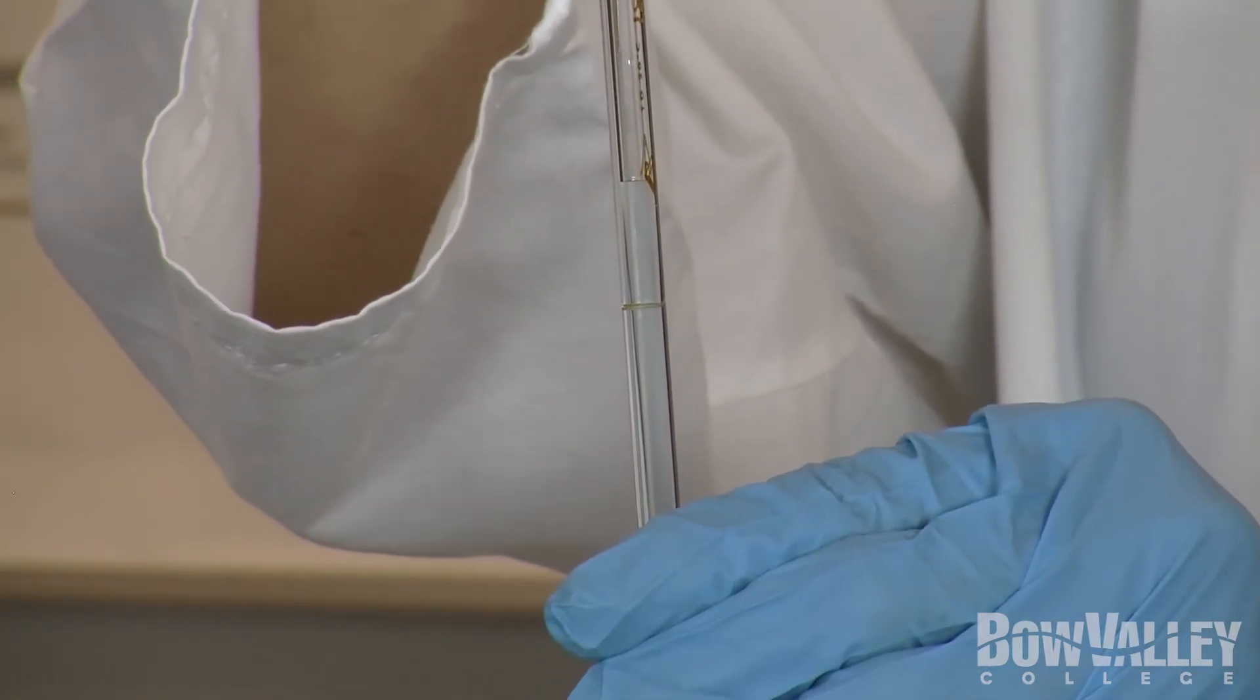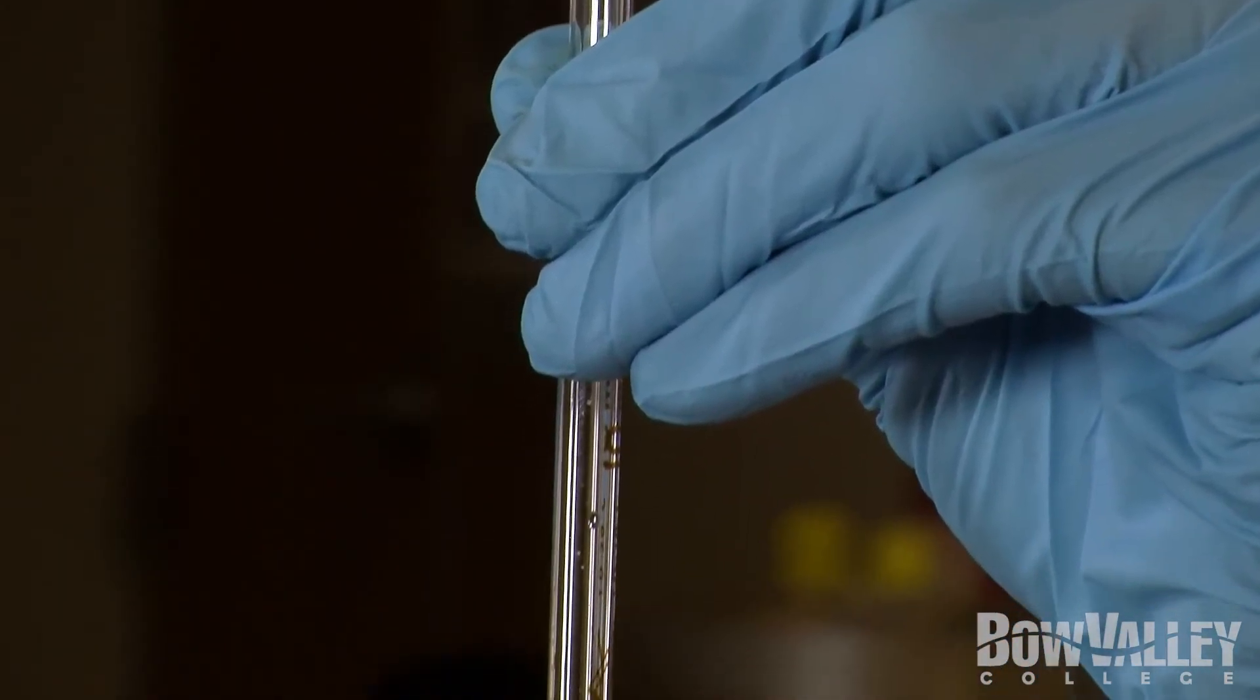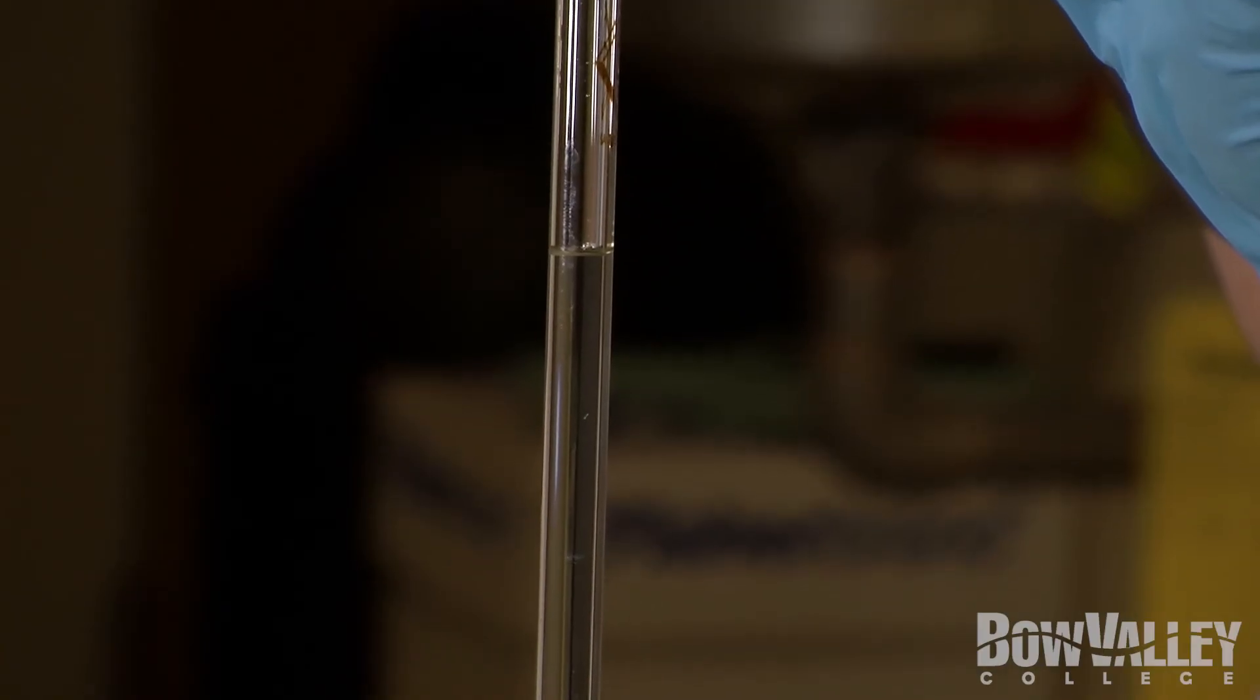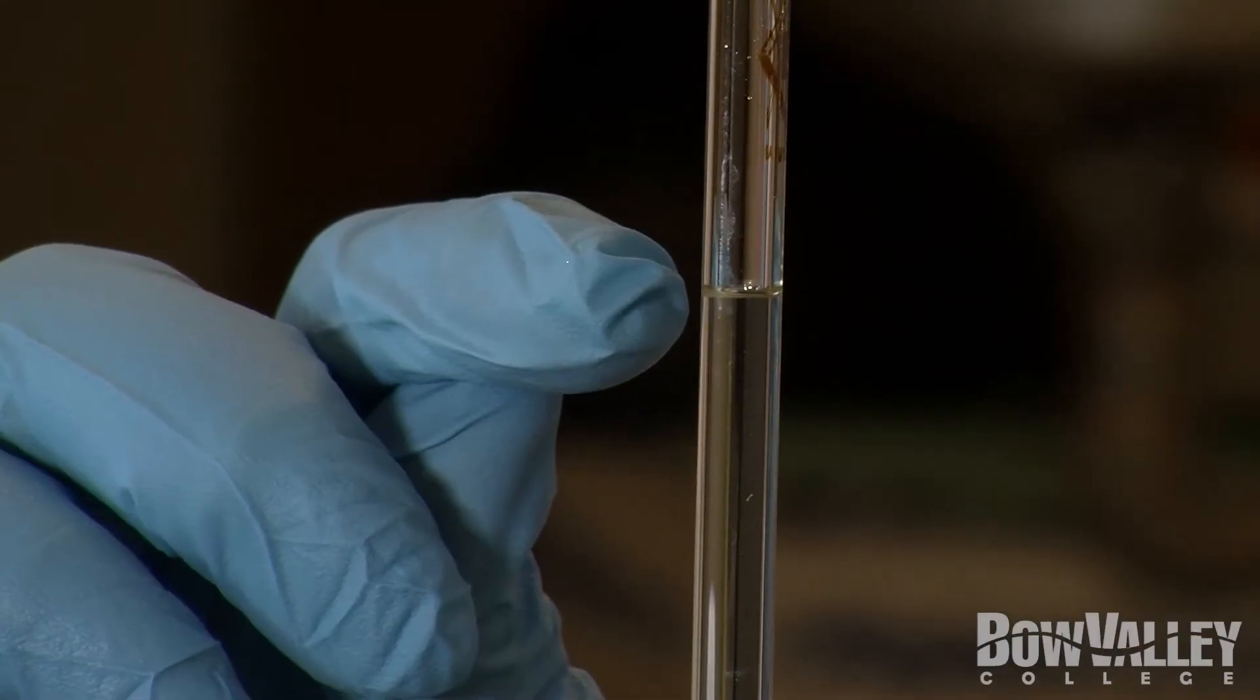Remove the bulb and quickly cover the end with your index finger, creating a seal. Slowly lift your finger and allow the liquid to exit until the bottom of the meniscus is sitting on top of the line marked on the pipette. If you allow too much to exit, simply use the pipette bulb to draw more liquid in and try again. This takes some practice, so be patient with yourself.